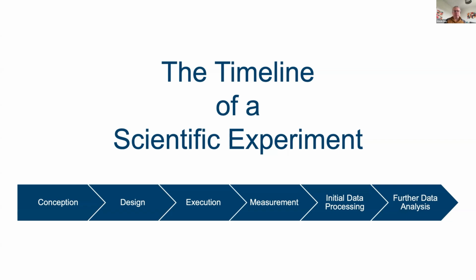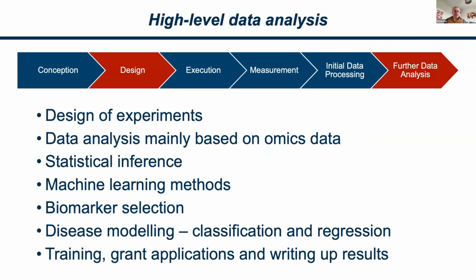data analysis of experiments. So as you can see here, here are some of the things that we actually do in terms of this. As I mentioned, the design of experiments here is very important, and we like to talk to people as early as possible when they're designing the experiments to make sure that they can get the most out of what they're planning to do and the most out of the money that they're going to spend. But most of our work is generally done on the further data analysis or the downstream data analysis. After much of the analytical work and the bioinformatic work has been done, we're here to probe the data in a deeper manner and try to get some big conclusions out of there if possible.